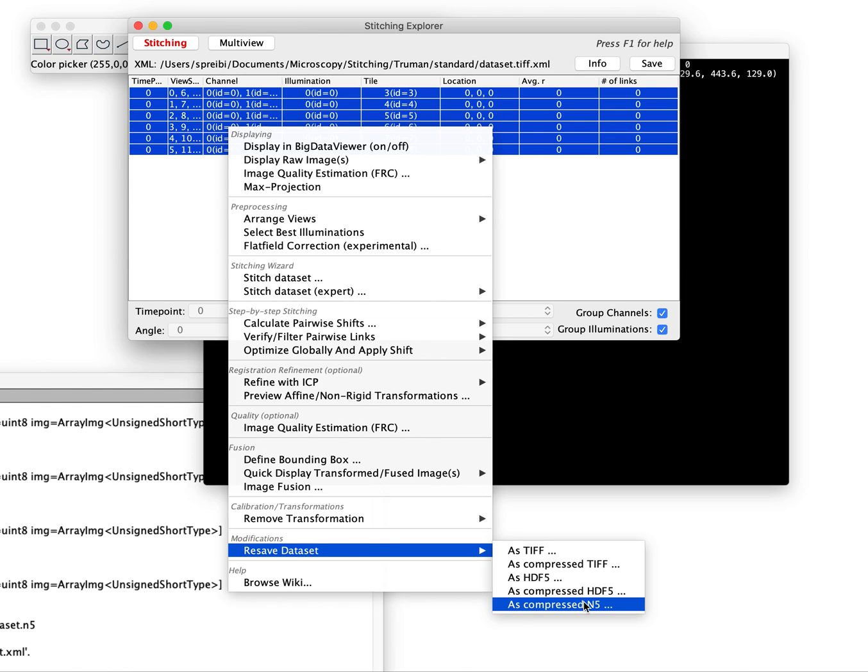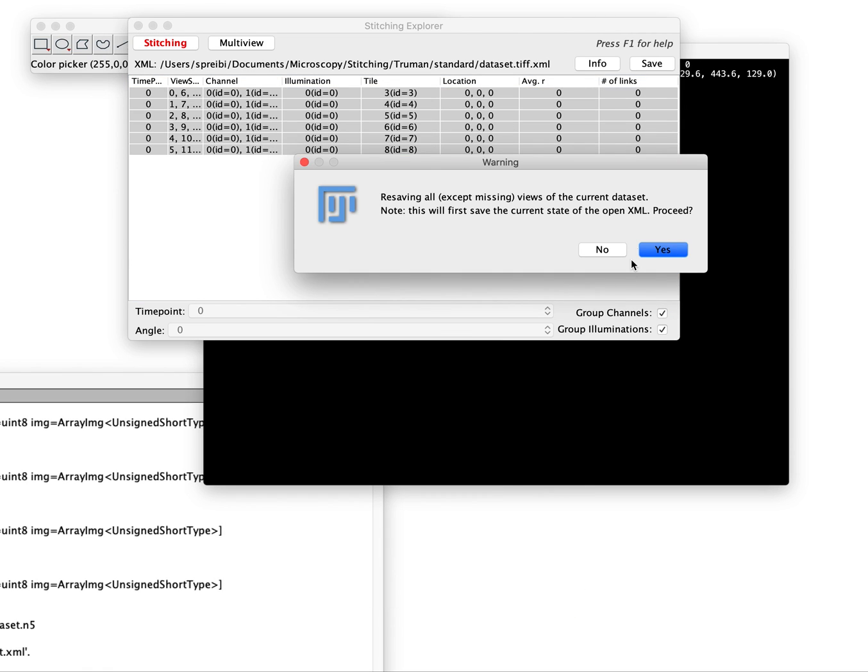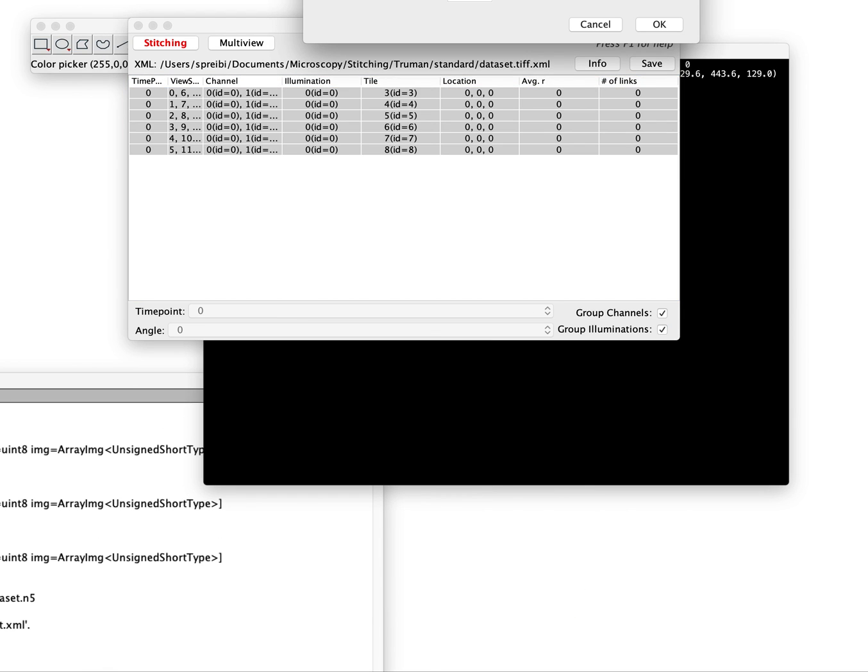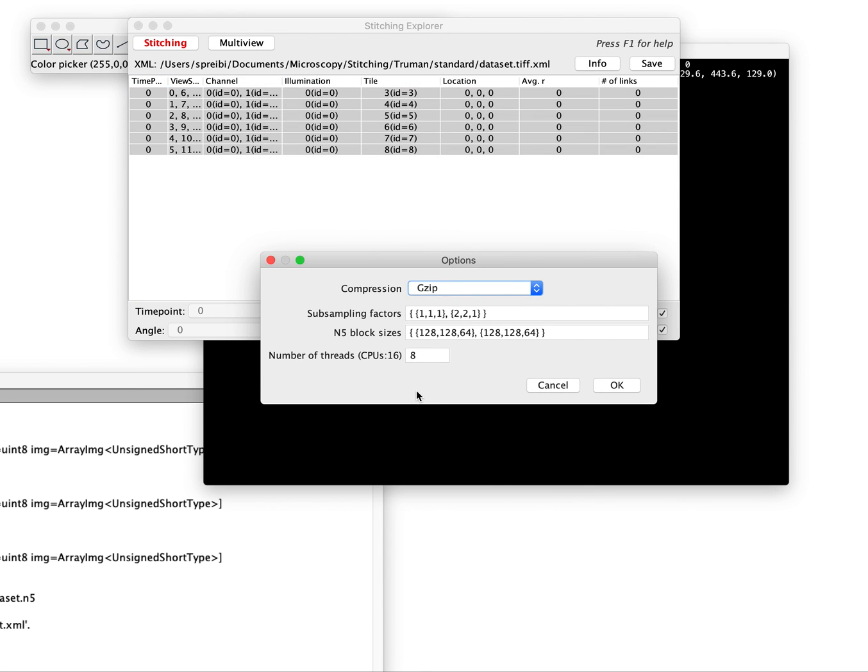Or if you did illumination selection first, this is a feature of BigStitcher for very large data sets. You could for example say all the illumination areas that I did not select I don't want to save. Then you save as compressed. You come up with the same parameters. I'm not going to do it again now. But that's basically the second way how you can resave, either using the auto loader in the beginning to choose it, or just not resave at this point and then later on maybe select a subset and resave them then.